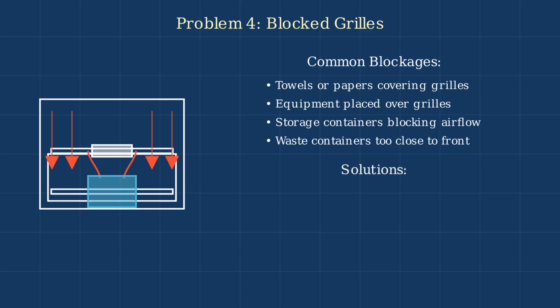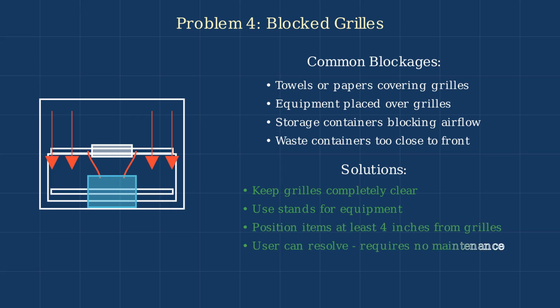To resolve grill blockage issues, always keep grills completely clear and use stands to elevate equipment when necessary. Position all items at least 4 inches away from grills. This problem is entirely user resolvable and requires no maintenance personnel.